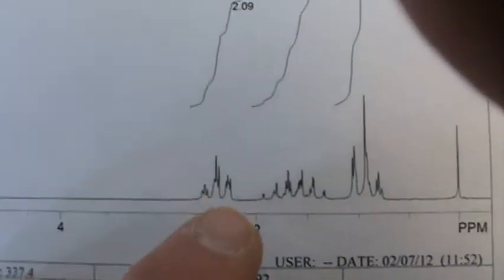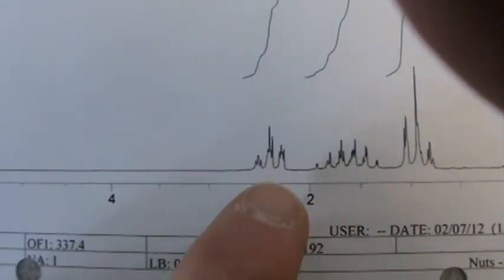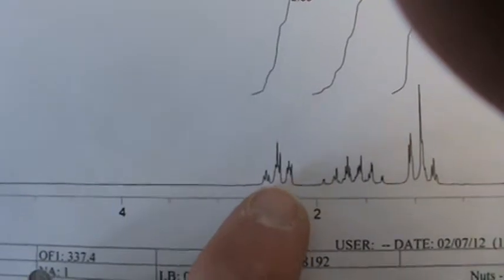However, that signal right there, as far as this is concerned, the CH2, should be furthest left in this region. So there we go. There's what looks like a triplet with extra splitting, right? The integration is 2, and it is what we thought, the CH2 next to the carbonyl. So it's further, and this one's only coming out, what, 2.3 or something like that?